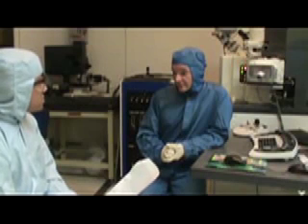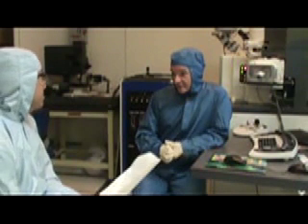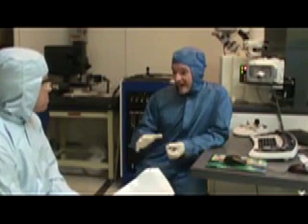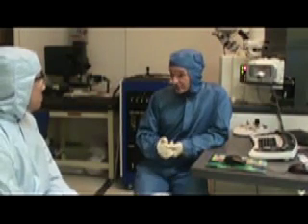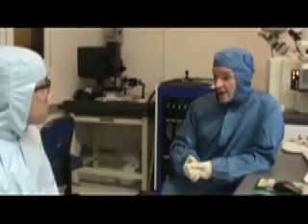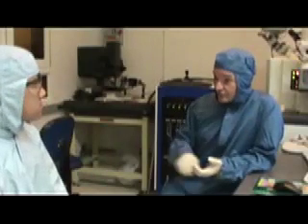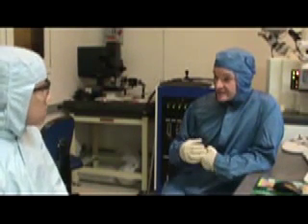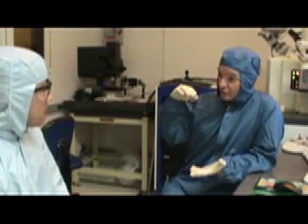How much more magnification does it have over, let's say, a regular light microscope? Typically, a light optical microscope will top out around 1000x. With the scanning electron microscope, depending on the calibration of the field, you can do upwards of 1,000,000 times magnification. We scan the electron beam back and forth across the sample, and through that scanning, we get an image of the surface of the material, not an image of what's inside.